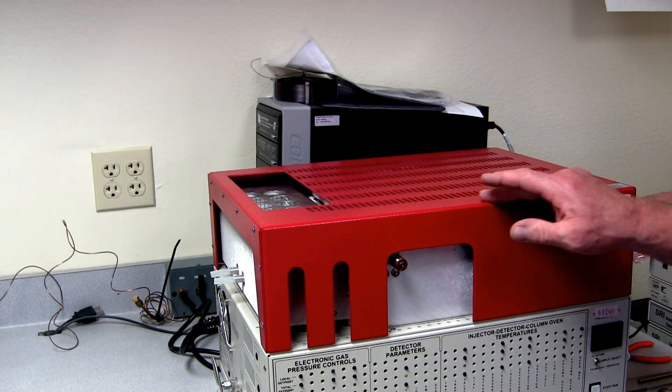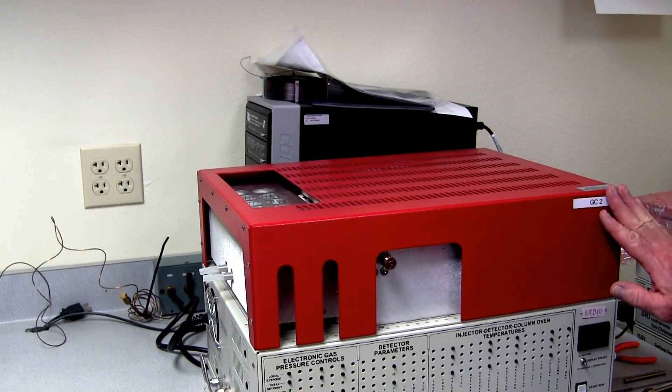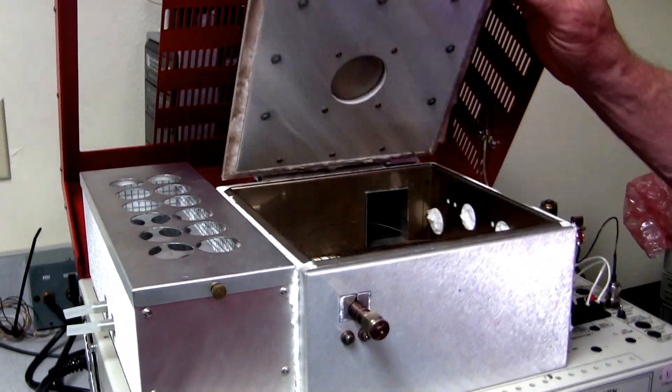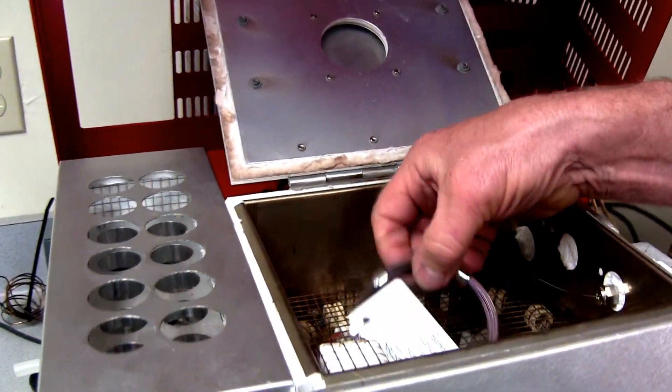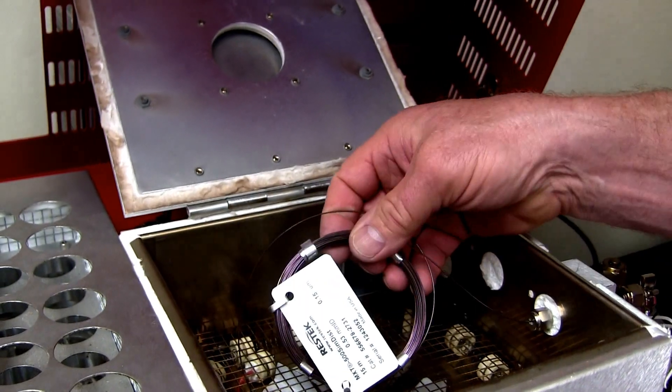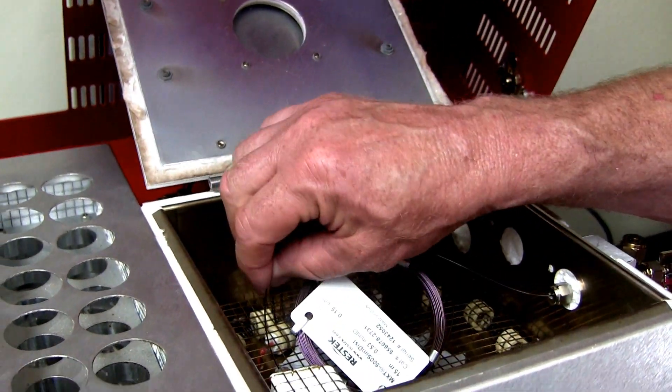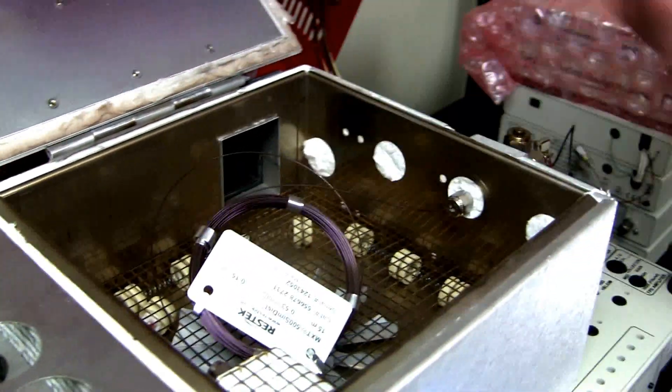So this is the SRI 8610 gas chromatograph and this is the column oven. You can see that in the column oven there is currently a column connected between the injector and the detector.